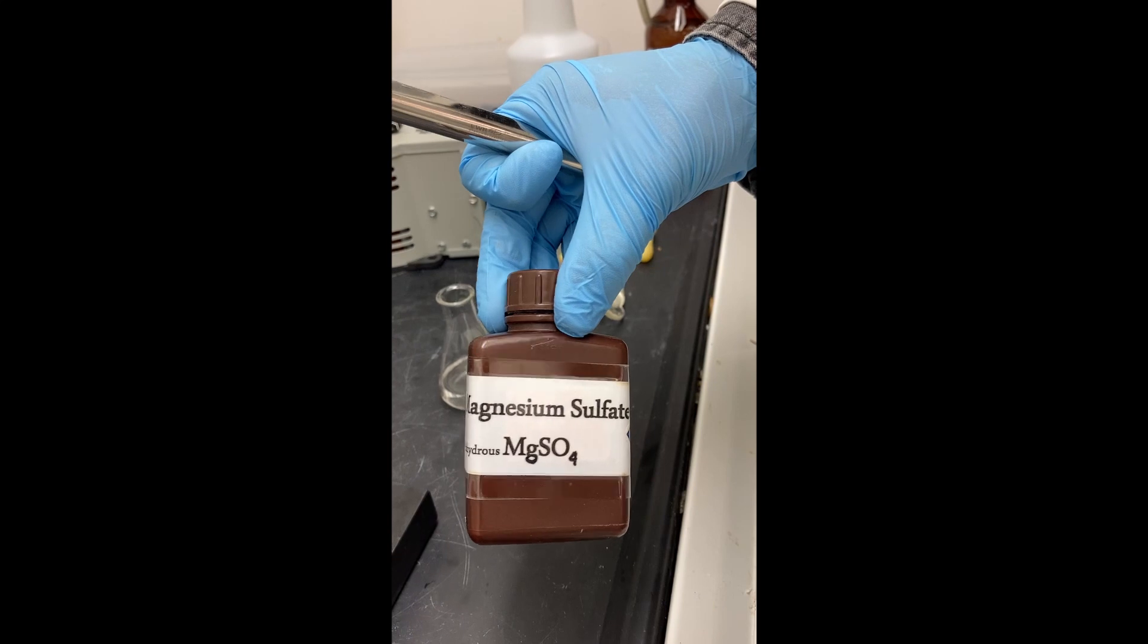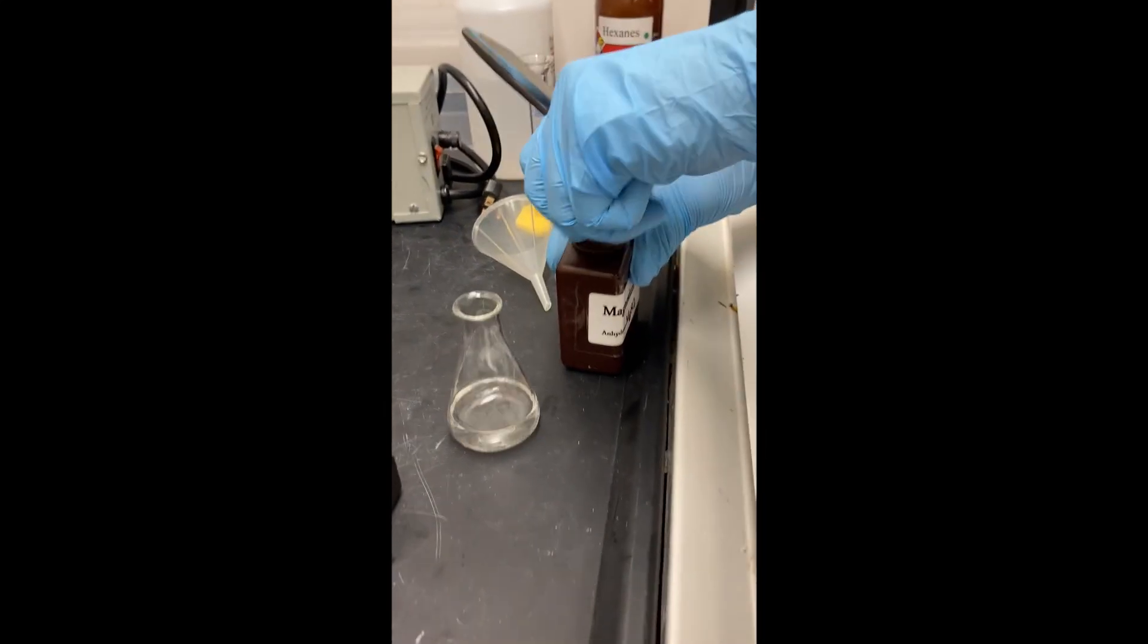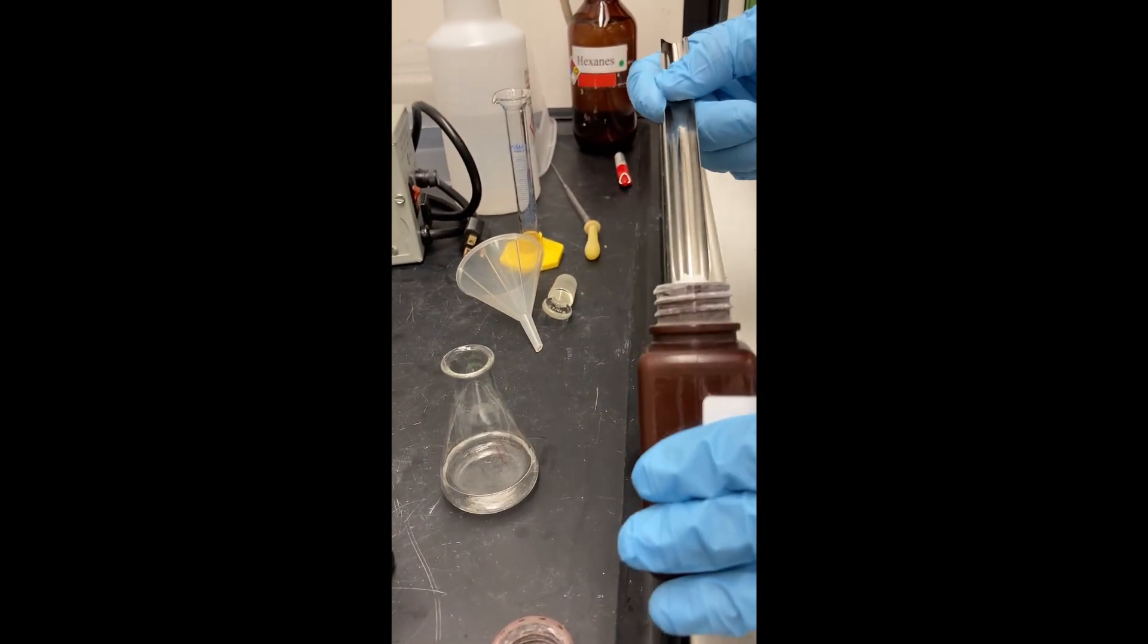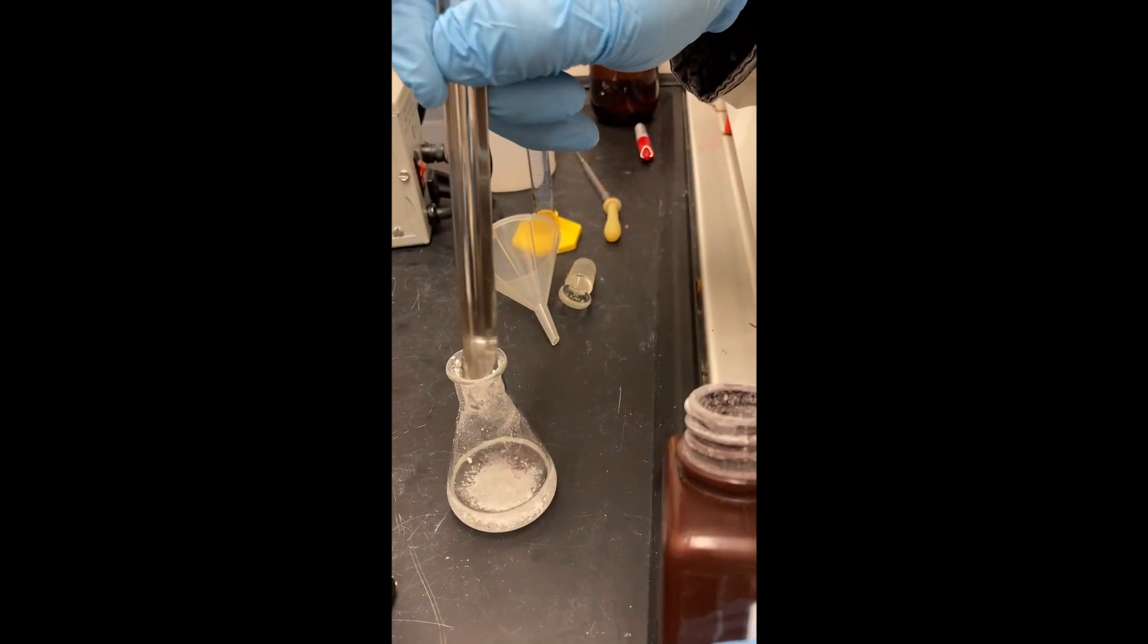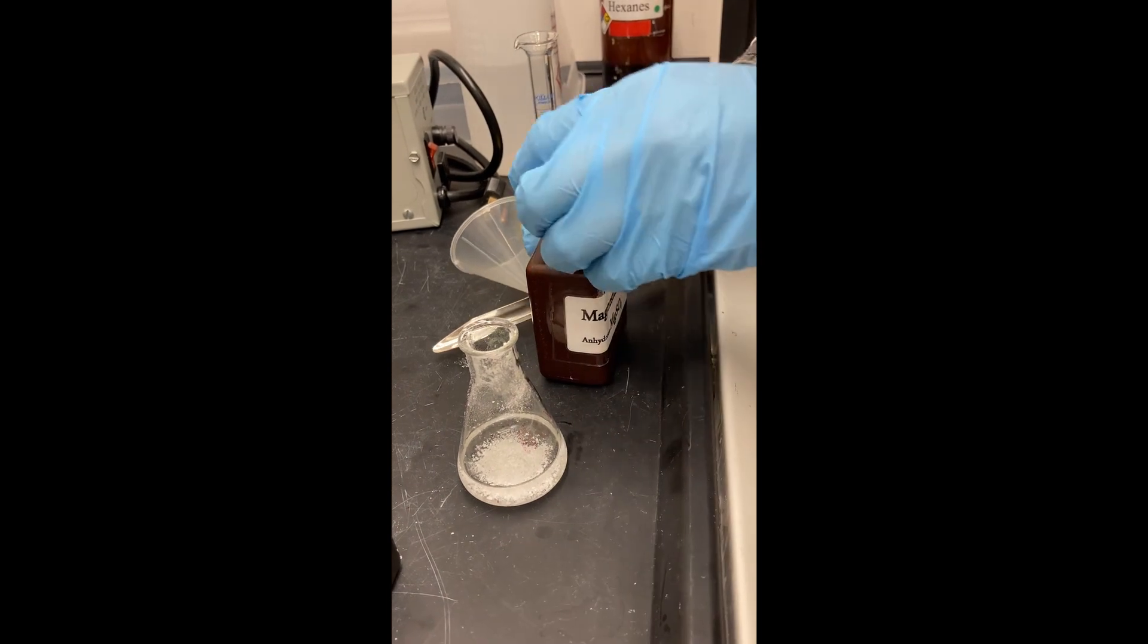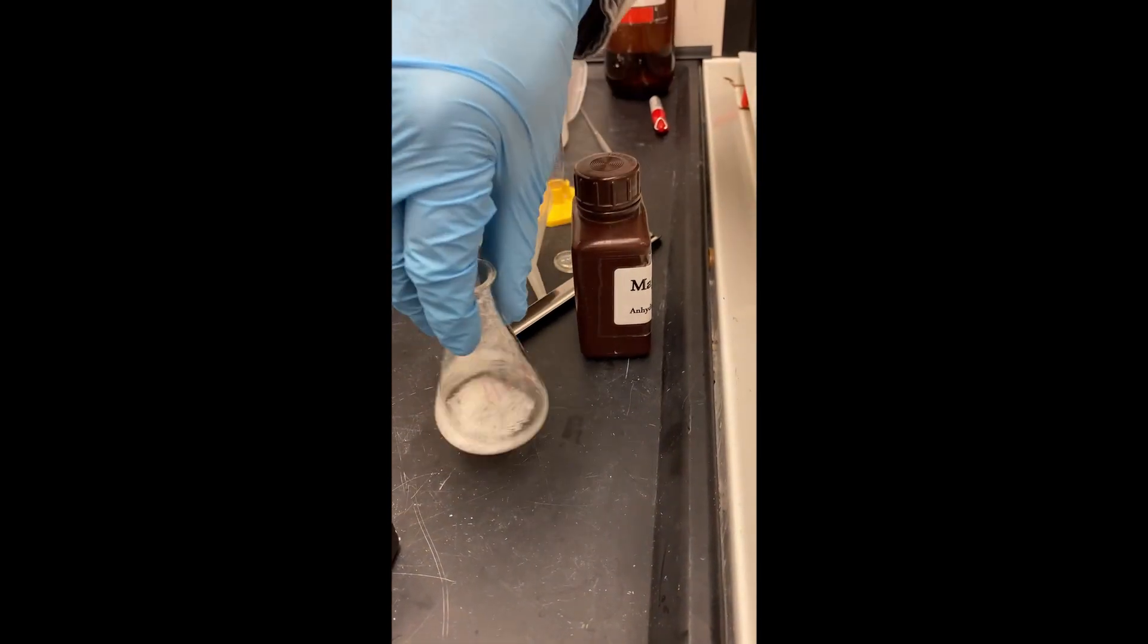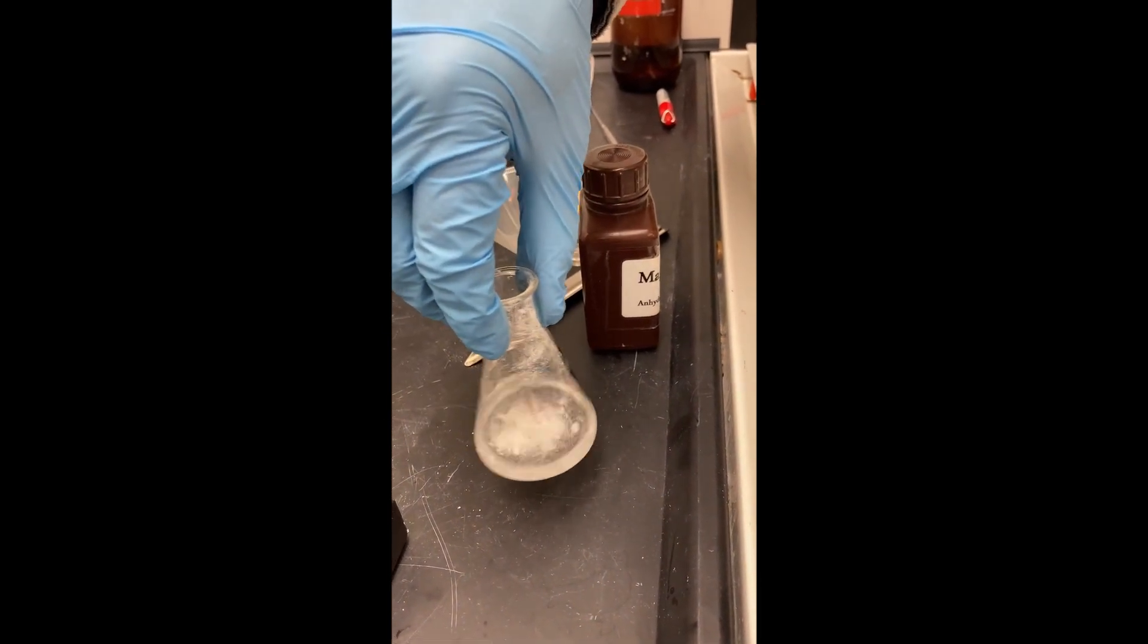Next, we want to remove any residual water from the organic layer using magnesium sulfate. When you swirl it up, if there is excess powdery magnesium sulfate, that's a good indication that it is dry.